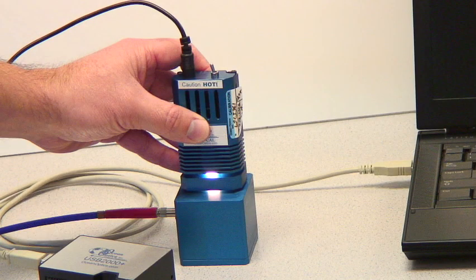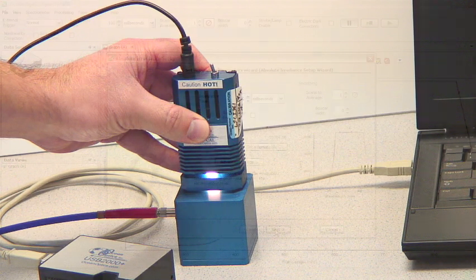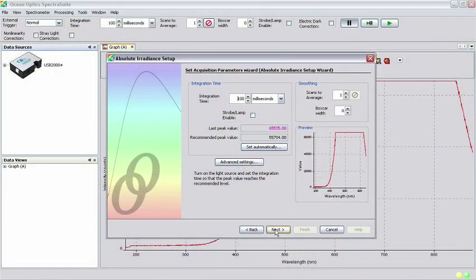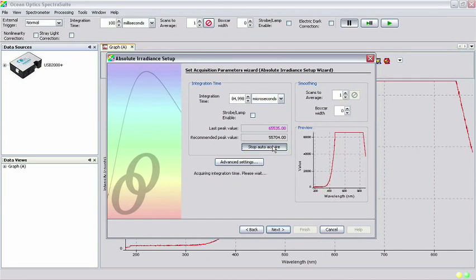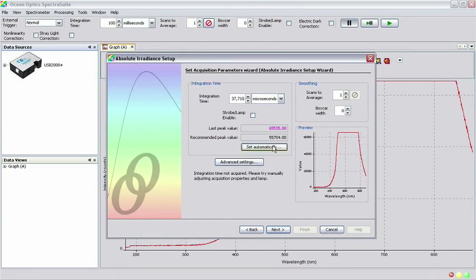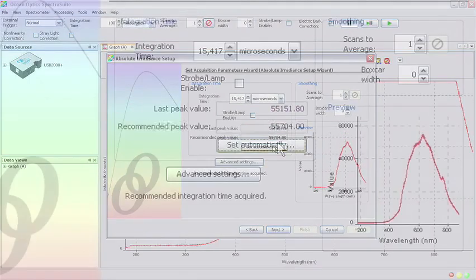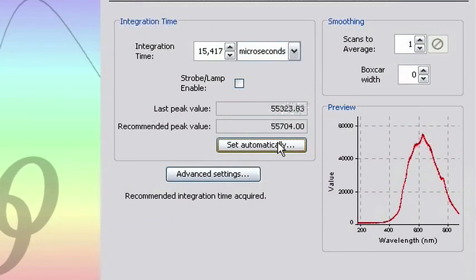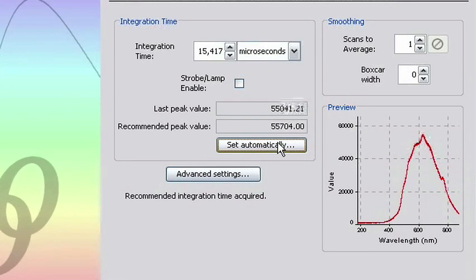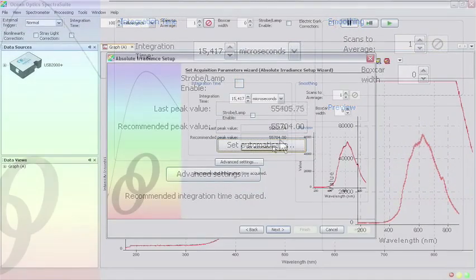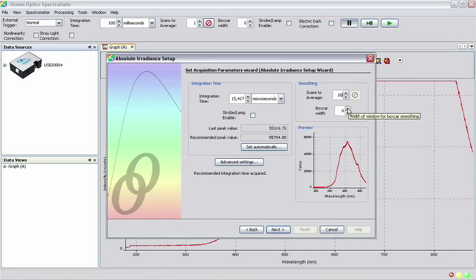Once the LS1Cal-INT is properly inserted into the integrating sphere, we can set the acquisition parameters. Clicking the Set Automatically button lets the software select the best integration time for your experiment. You may have to click this button more than once to get the last peak value and recommended peak value text boxes to both turn black, indicating that the software has chosen an appropriate value of the integration time. Add any averaging and boxcar smoothing in the window and click Next.